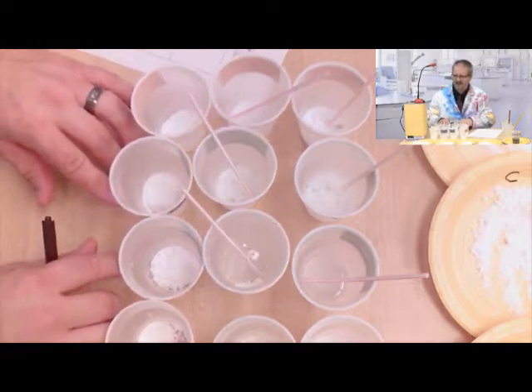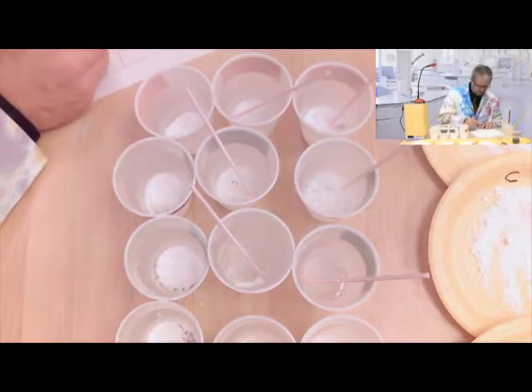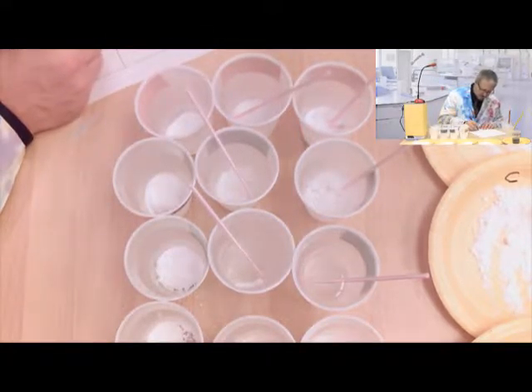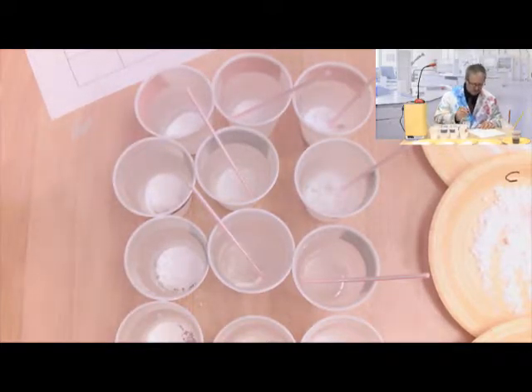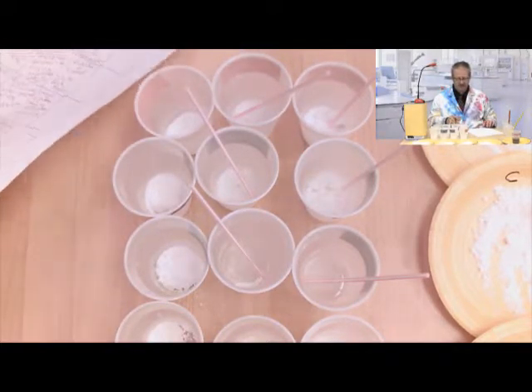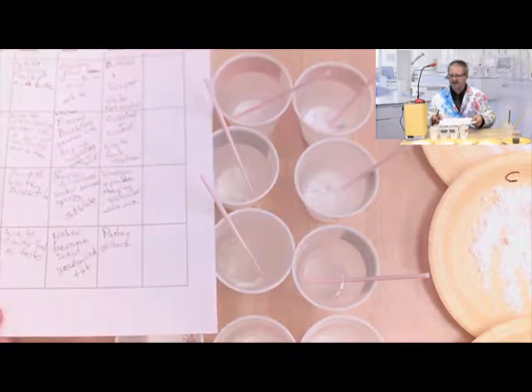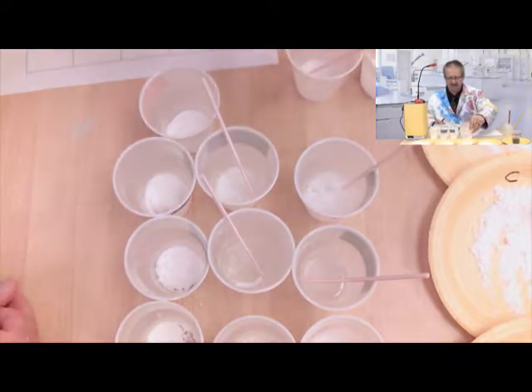That one got real pasty. Did it change color? Yellowish. So pasty and yellowish. Okay, we are done with those.